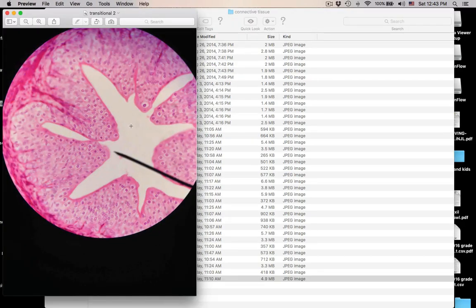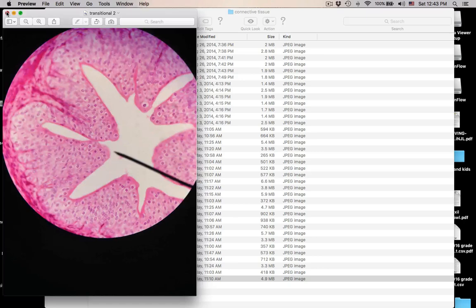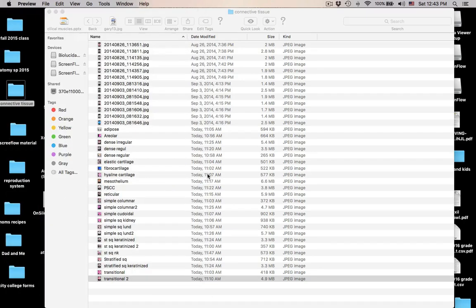Same thing — another example of transitional epithelium. Look at the apical cells; these are not flattened. This is transitional epithelium.